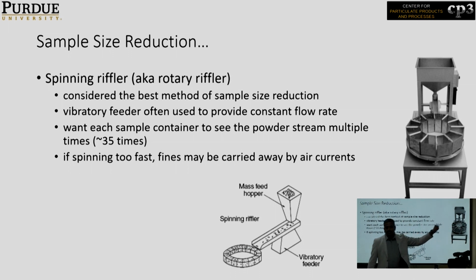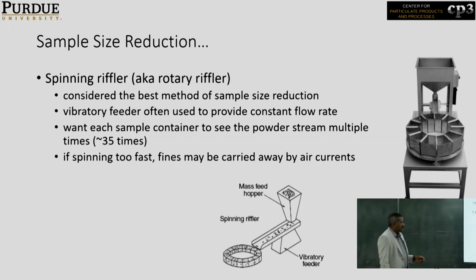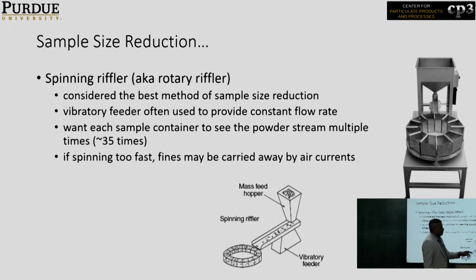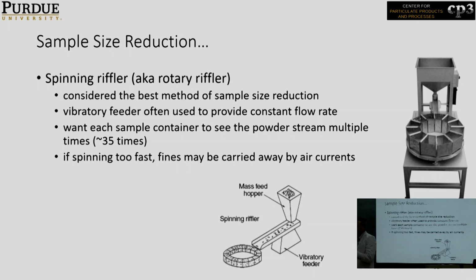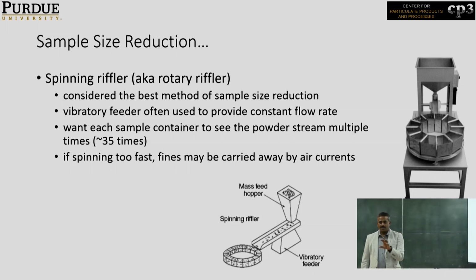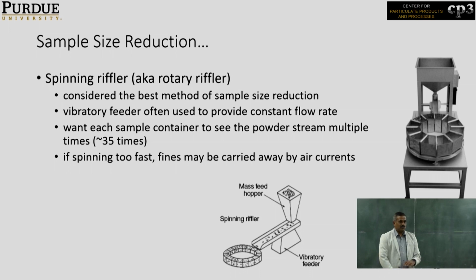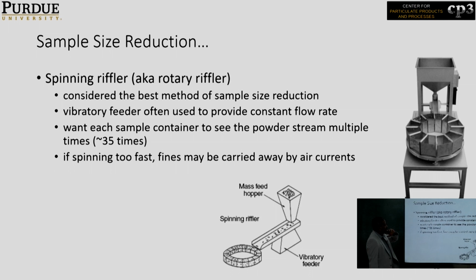These compartments are rotating, not stagnant, at one constant RPM. The powder is collected in individual compartments at multiple times, and then you take those subsamples. For most powders, we have to optimize the RPM before we subsample to give a better result.